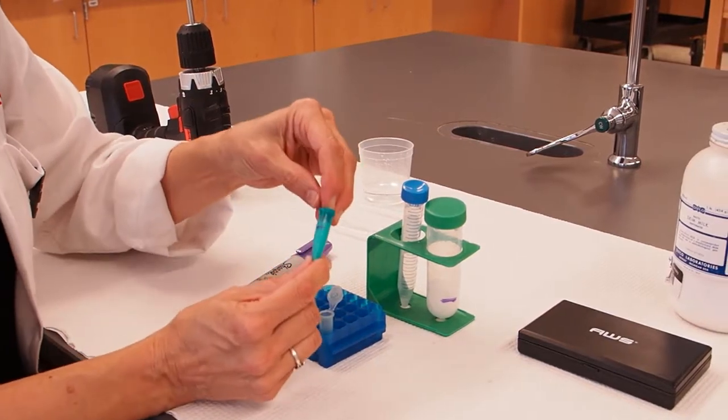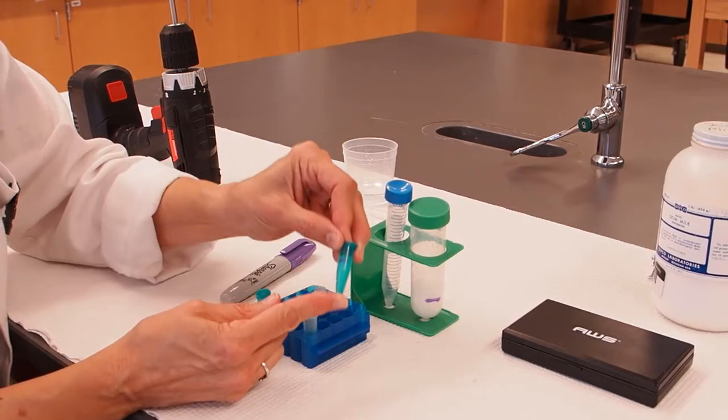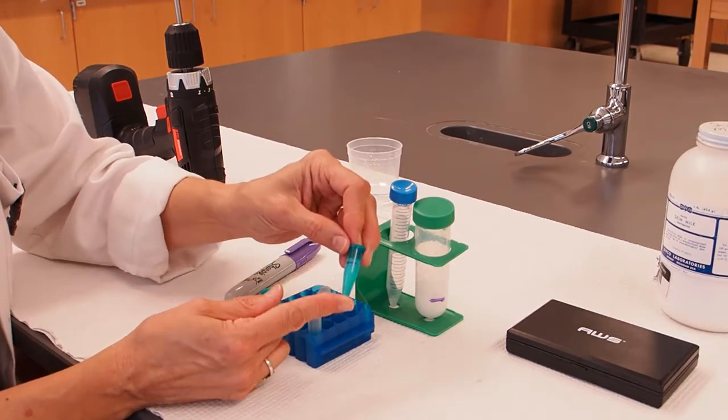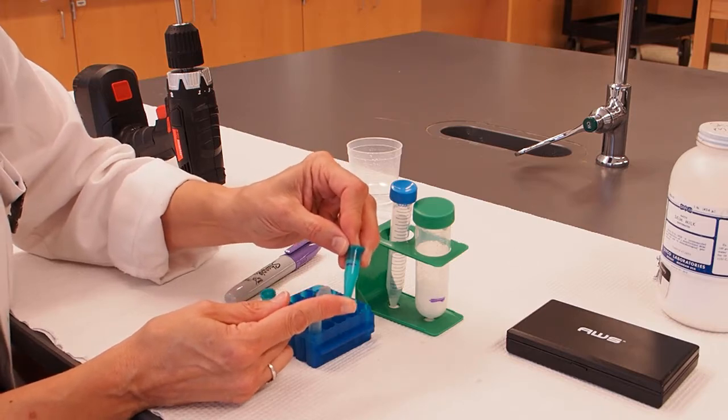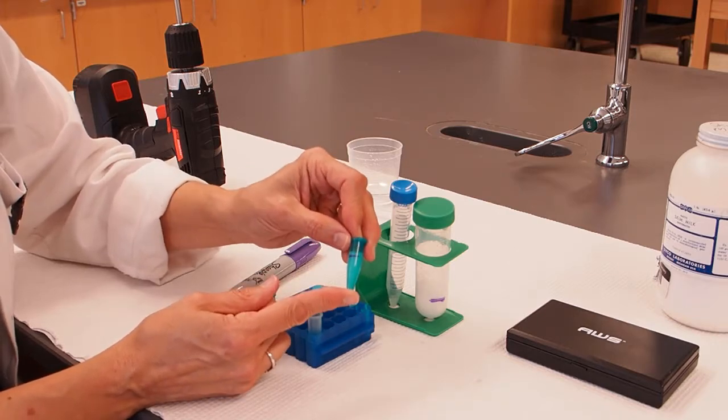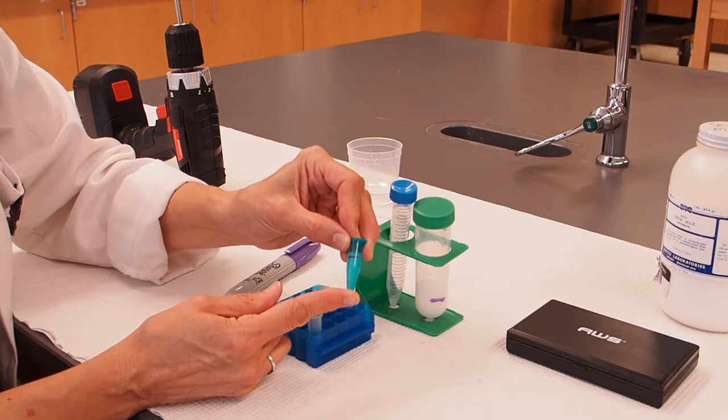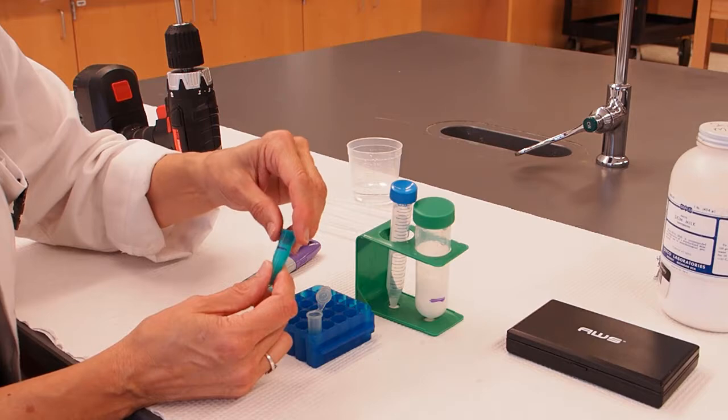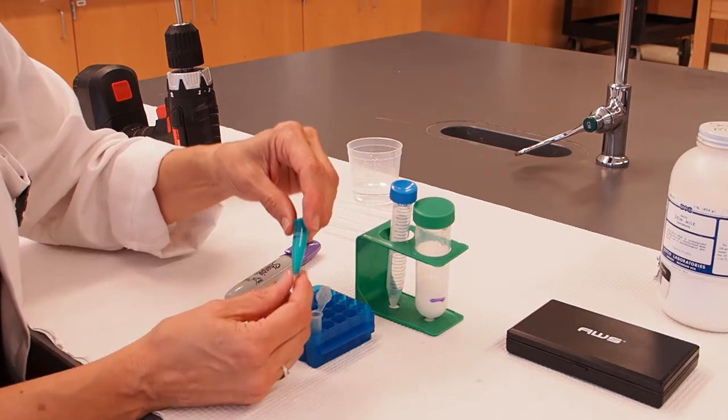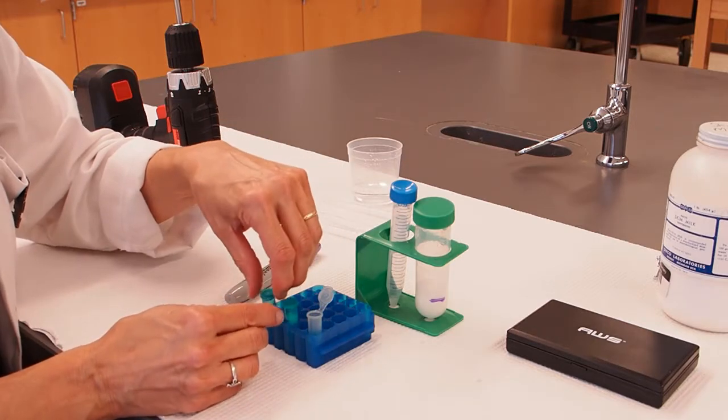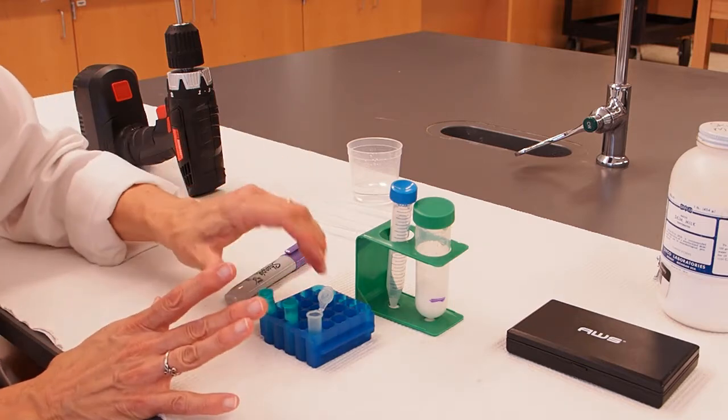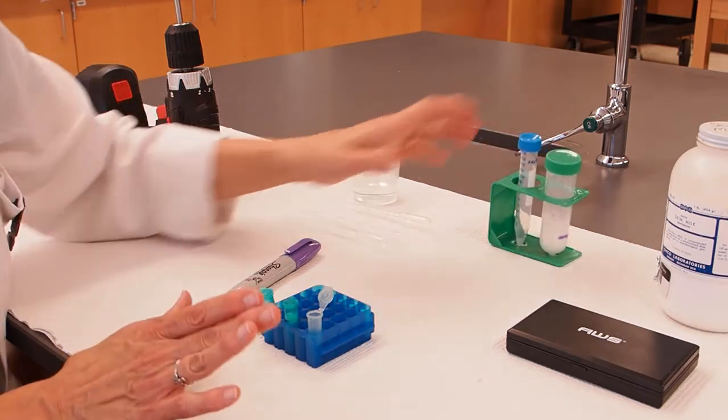It will take time for the chemical reaction that causes the proteins to clump together to occur. That reaction will happen faster at a warmer temperature. If you have a heat block that works, you can set it to 37 and put this in your heat block for five minutes, or put it in your pocket to keep it warm. If you don't have a way of warming your sample, then just leave it at room temperature for a little bit longer. So 10 minutes would be good.